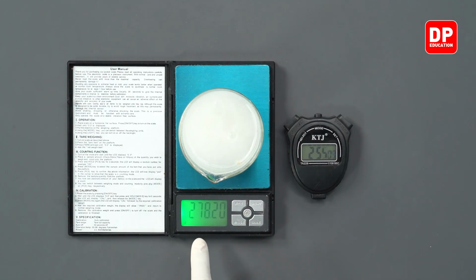Ninth reading is 278.16, and finally the 10th reading. 10th reading would be 278.01.